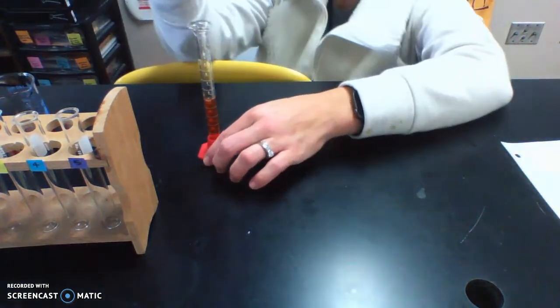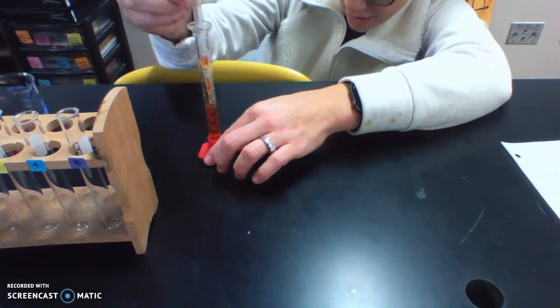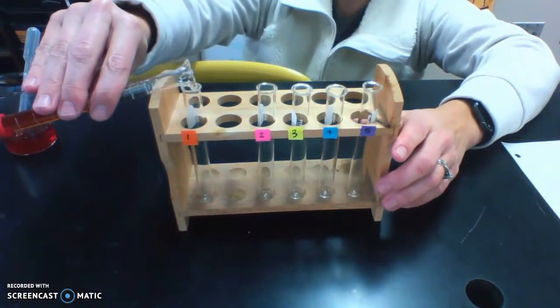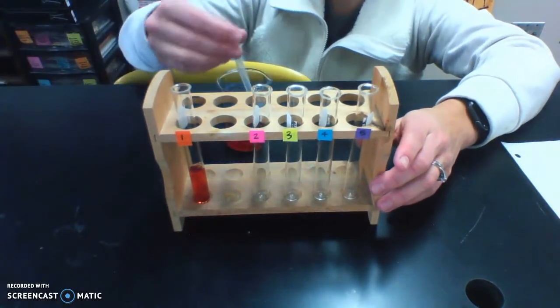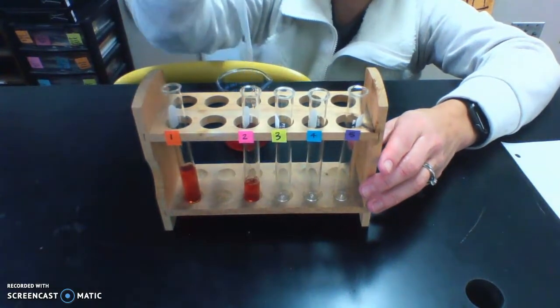We're just getting qualitative data. All right, so I'm going to add this to here. And then I'm just going to use my dropper to get about the same amount in each of the other ones.